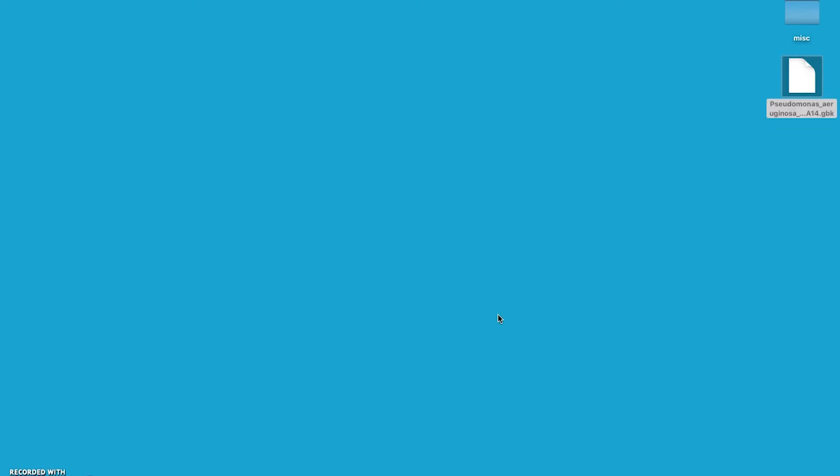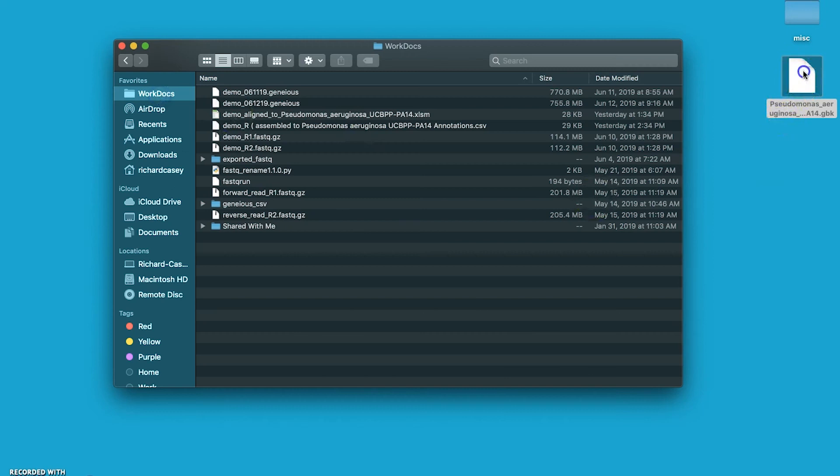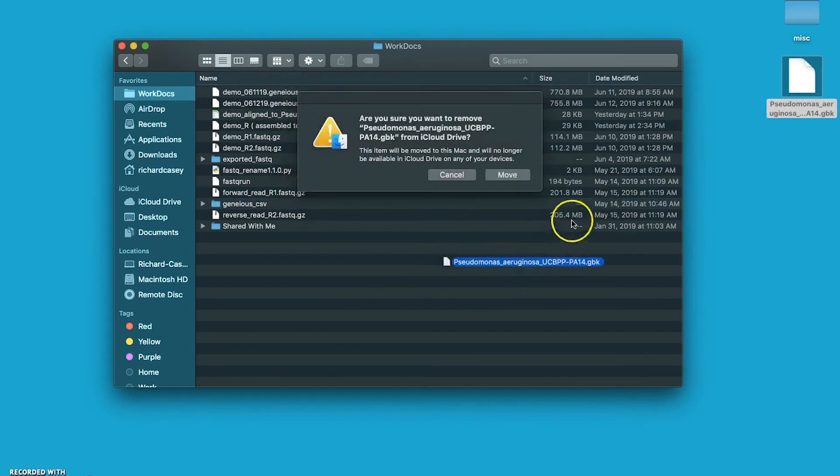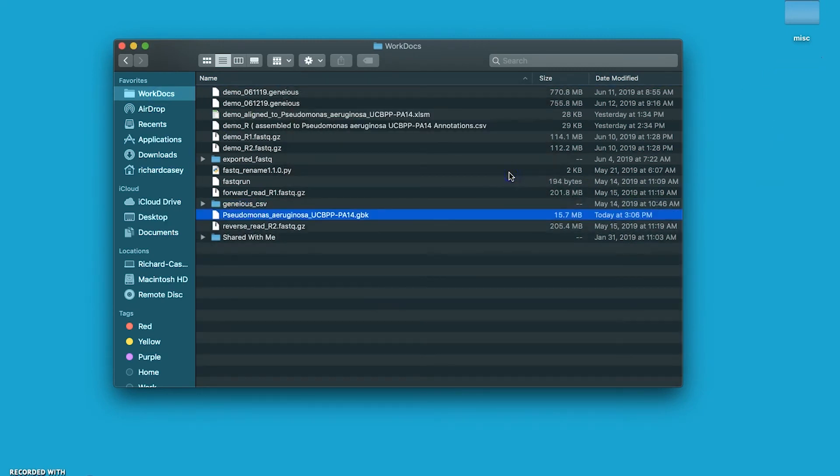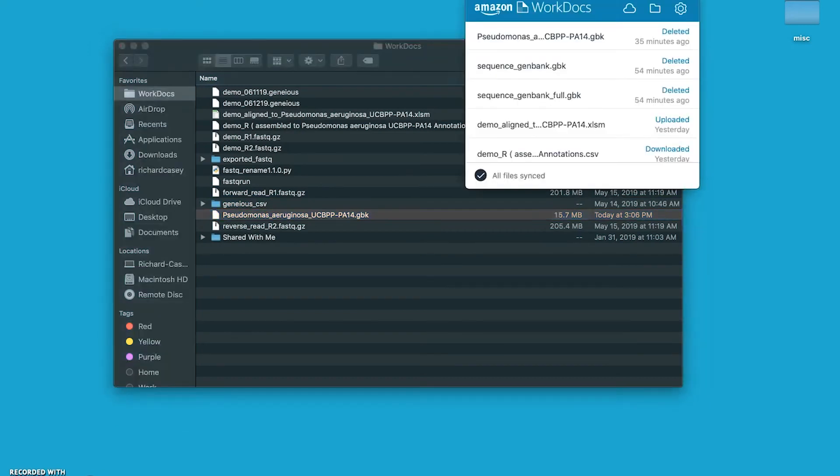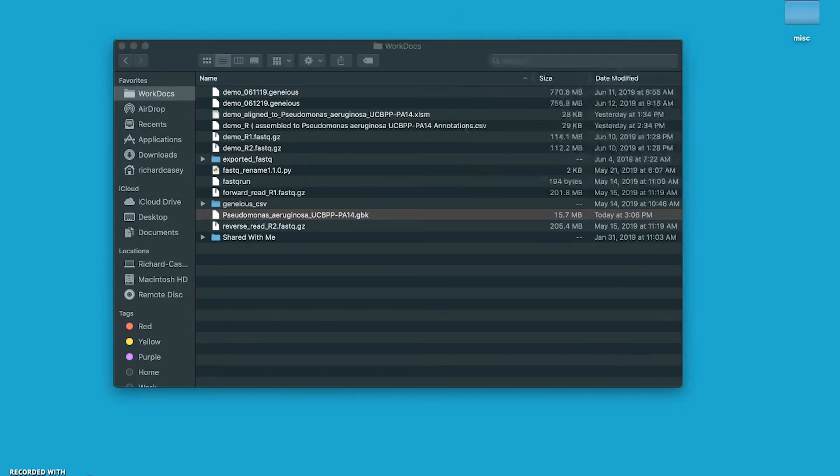Now in our case, we happen to be using Amazon AWS Cloud, so we need to push this file to the cloud. We want to drag this file over to WorkDocs, move it there, and then in a couple of minutes we'll see this file syncing up with AWS Geneious in the cloud. So we'll wait for that to finish. Okay, so it looks like this file has been synced to AWS.